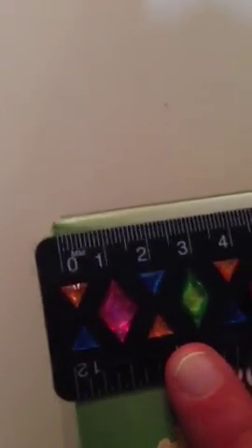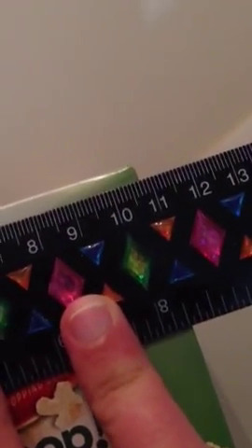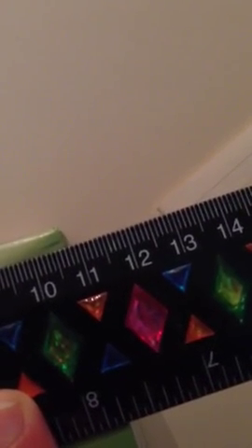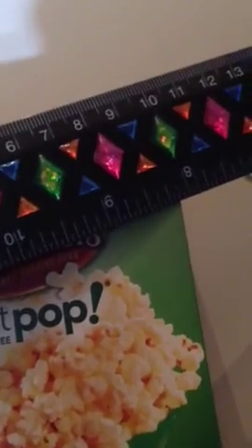So we need to do width and height next. So the width, again, we'll line up our ruler, the edge of the container, and it looks like this one is how many lines past the halfway point? 1, 2, 3. I'll call it 10.80. And there's no real way to know if you're estimating perfectly. Just do your best job.